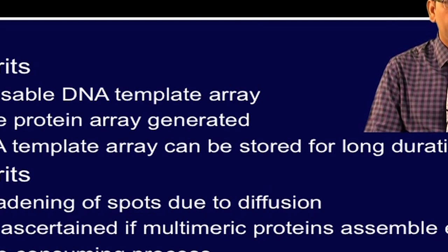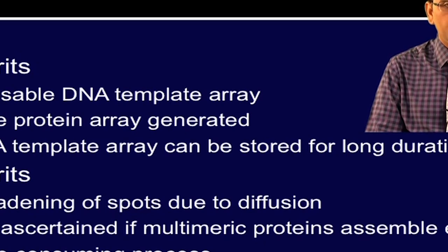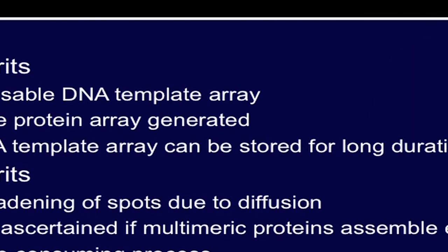When there is a need for making the protein array, one can use the membranes with the lysate and then followed by generation of multiple protein arrays. However, there are certain limitations of using DAPA method, including the broadening of spots due to diffusion. It is not ascertained if multimeric protein assemble effectively. It is also a time consuming process.